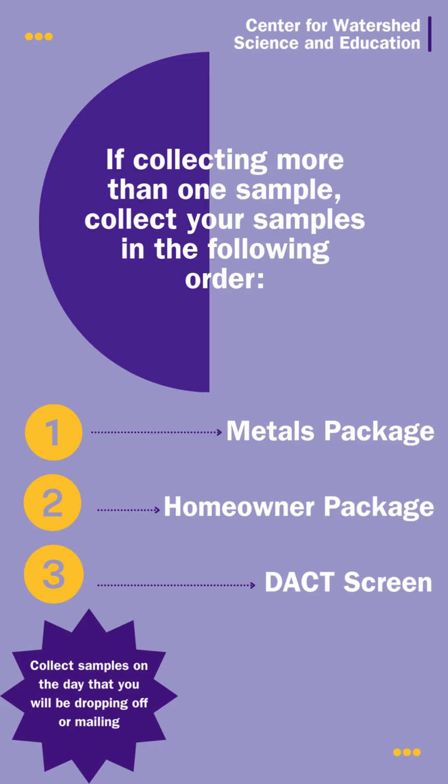If you are collecting more than one sample, collect your samples in the following order. First, the metals package, next, the homeowner's package, and lastly, the DACT screen. It's imperative to collect your samples either on the day that you will be dropping them off at the lab or the day that you are mailing them to the lab.